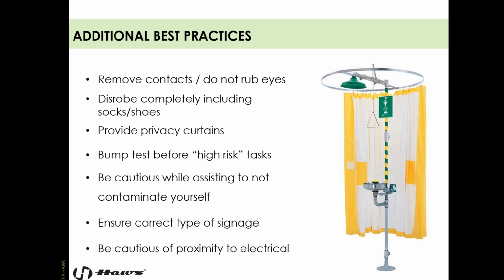Ensure the correct type of signage. You don't want an Eyewash sign where there's a combination unit, or combination unit where there's an Eyewash. We don't want to give the wrong expectations.